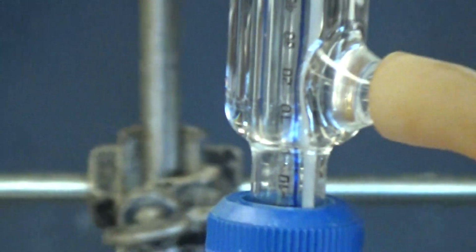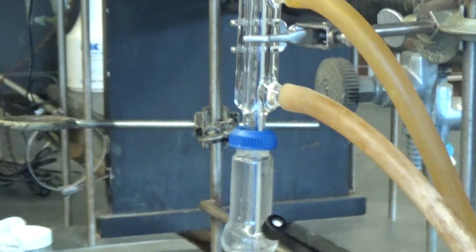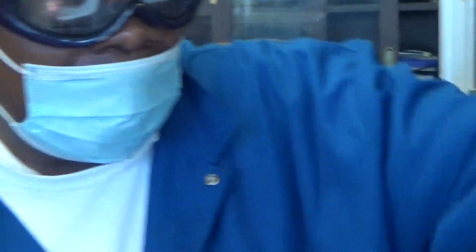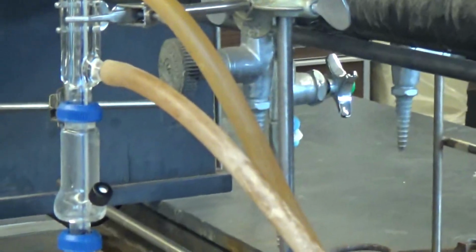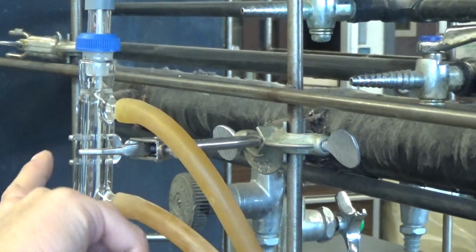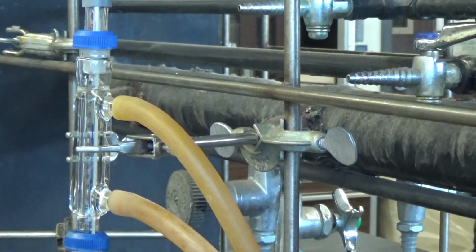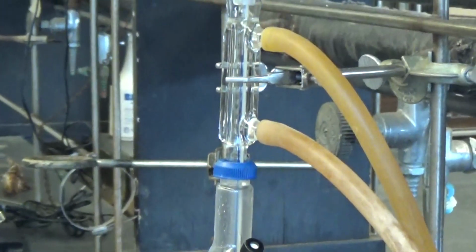And what's the purpose of the condenser again? Up top, it's like the water. When you distill, you have boiling, vaporizing, condensing. If you don't have a condenser, you are not going to have any condensation. That means that you are not going to collect anything. It's just going to vaporize and sneak out the top. So the cold surface up here, I can touch this. Not that, below. That's nice and cold. So when the vapors climb up, they touch the cold surface and condense.